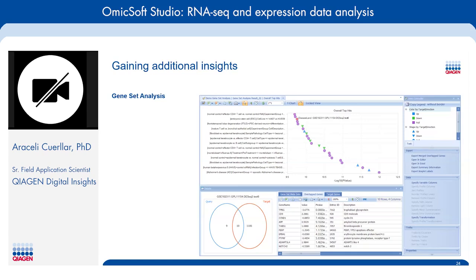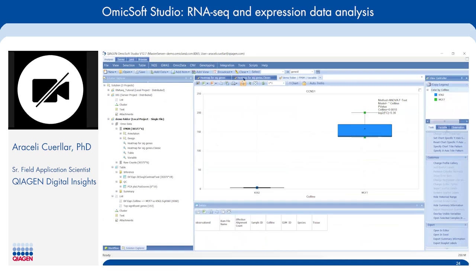And so in OmicSoft, you can perform such analysis by using the gene set analysis option within the GUI, by going to integration and then gene set analysis.